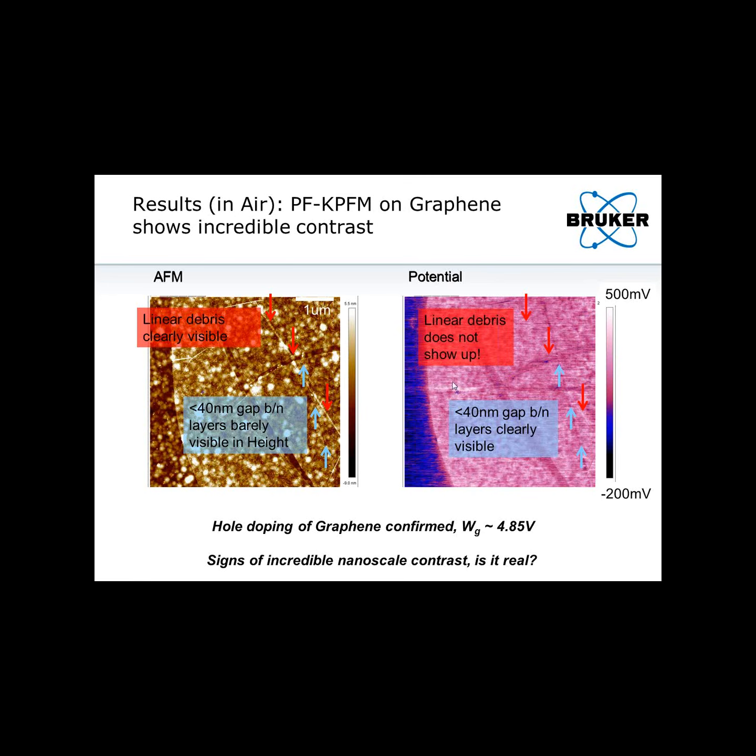Graphene, on the other hand, definitely lights up, and you have a very large contrast. If you take an average of all of the graphene here, you get approximately 0.35 to 0.4 eV, and our tip is around 4.5. So this means that the work function of graphene is approximately 4.85. So we are far away from intrinsic graphene here, because intrinsic graphene should be around 4.6.